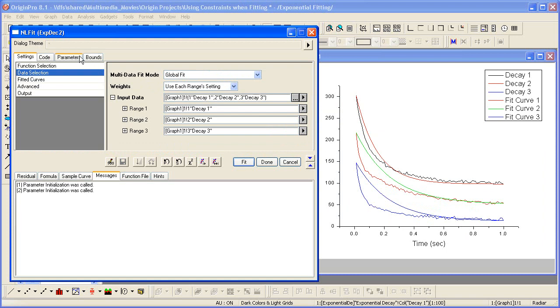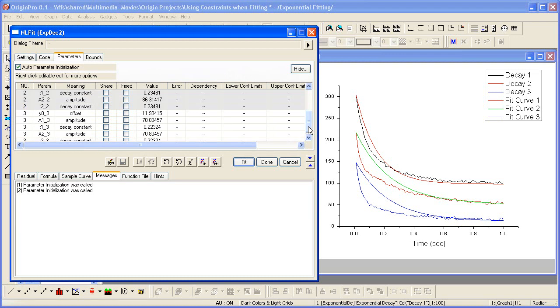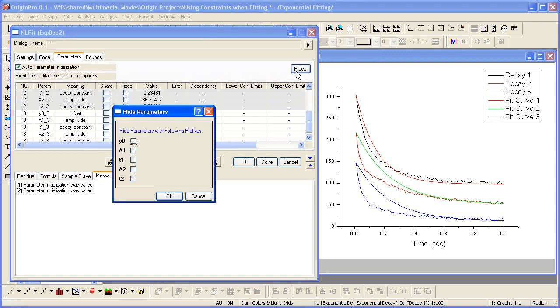Now let's go to the Parameters tab. We have three sets of parameters, one for each of our input ranges. To make this list shorter and therefore easier to work with, I'll click the Hide button and hide all but the T1 and T2 parameters.